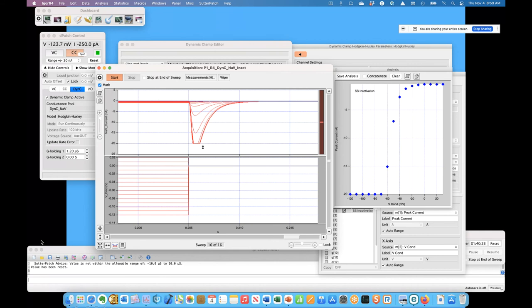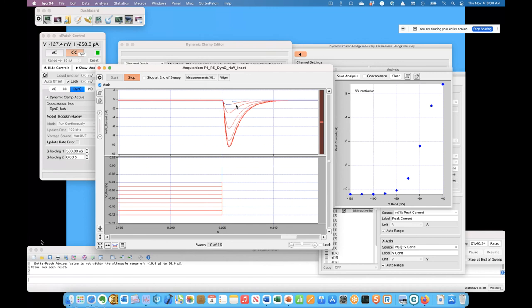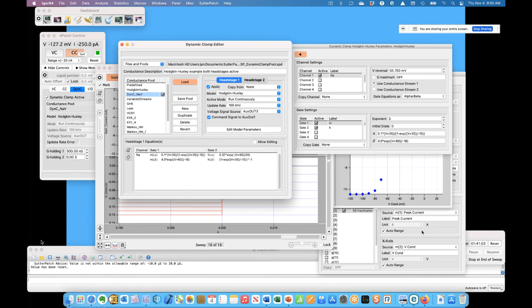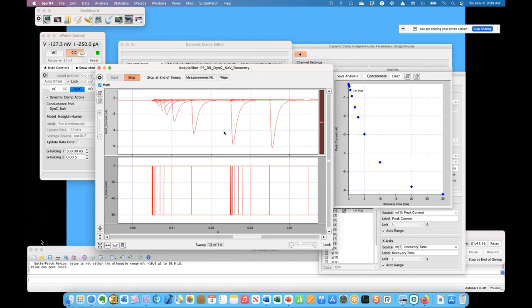And then what we're getting is sodium inward currents here. And again, this is my model cell. My totally passive model cell sitting on my desk generating what looks like sodium currents that are governed by the conductance model, the Hodgkin-Huxley model that I have loaded. This can also be used for assay development. And let me just show real quick the other two. Back to the routine editor. The voltage-dependent inactivation. So what we see here is at the end of an inactivating conditioning step, we see the current activating more and more. But we also see it's bottoming out here at the beginning. That is because my holding conductance is too large. So let me put that 0.5 micro and run that again. And now it doesn't bottom out anymore. And we get the same, should have only auto-scaled the y-axis here. Get the same thing. And very briefly, let me run the recovery from inactivation.